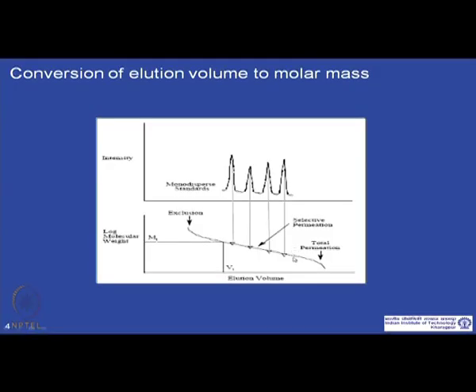We do actually see that the elution volume decreases linearly with log M, and this has been taken advantage of to make a calibration curve, where known standard, very monodispersed polymer samples which have very low polydispersity, like in this case 4 samples are shown here, are injected and their elution volumes are recorded, and likewise a calibration curve is constructed by injecting many monodispersed polymer samples.